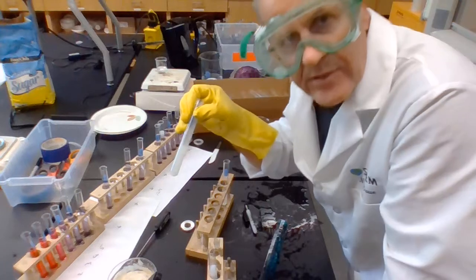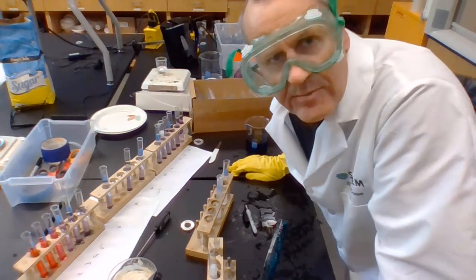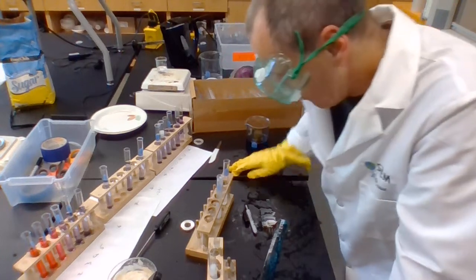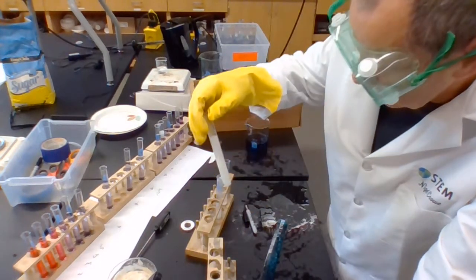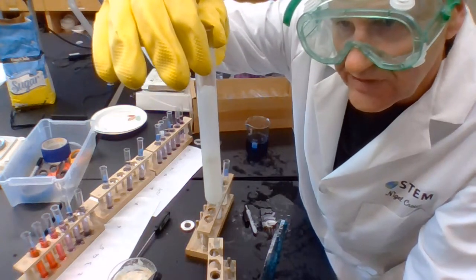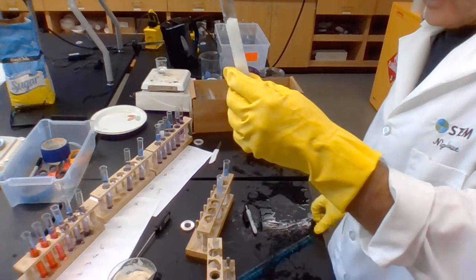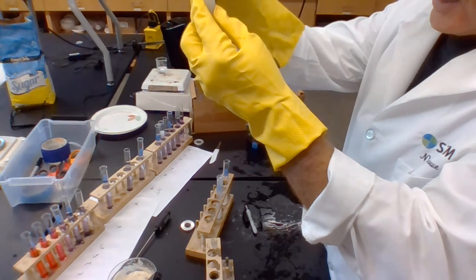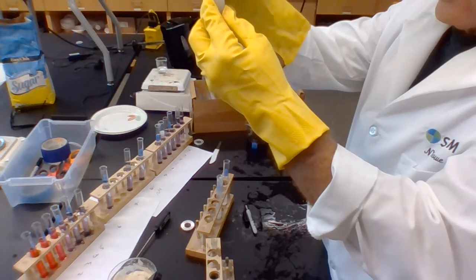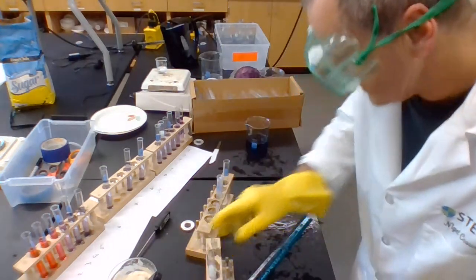At a medium temperature, around about 24 degrees, it produced around about 85 millimeters of bubble. At something like 14 degrees, 12 degrees, I've forgotten what it was. Let's measure that. That's a bit of a sleeper. It did 60 millimeters.